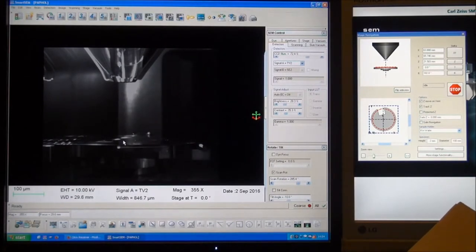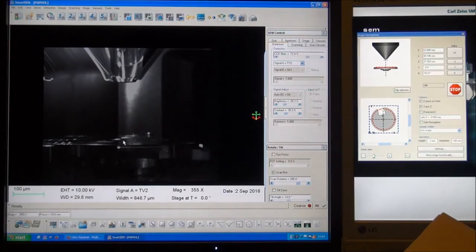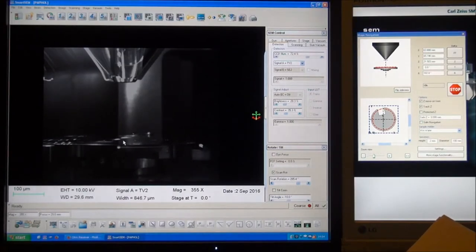You should look at the TV signal every time you move the sample closer to the pole piece.